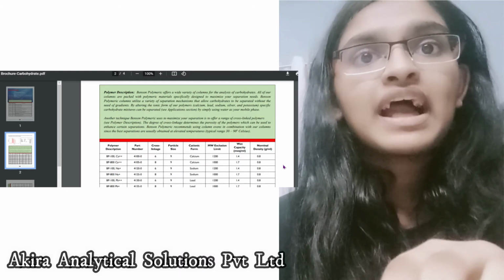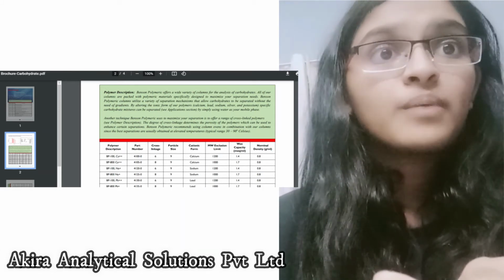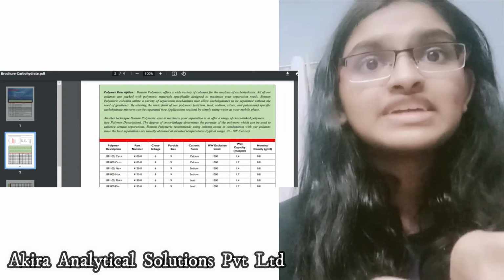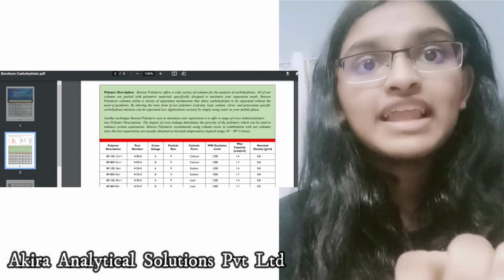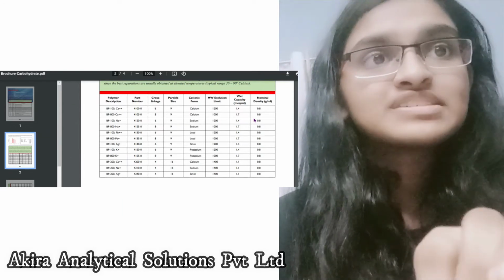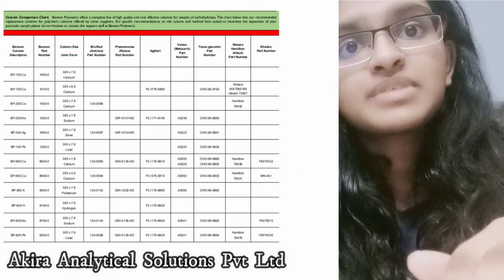Here we have polymer descriptions and part numbers, cross-linkage, particle size, cationic form, MW exclusion limit, wet capacity and nominal density for each of their polymers. That includes the calcium, sodium, lead, silver and potassium among the polymers listed, and all those details for you to get the best reference possible. And then we see the column comparison chart.